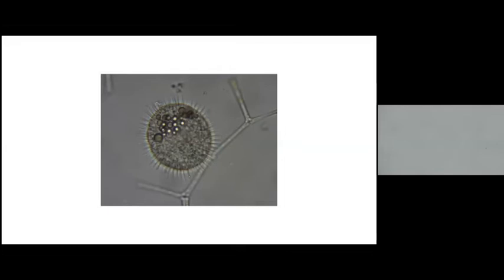I'm noticing that it's pretty circular, right? That might be why someone said cell. Another reason someone could have said cell is because it takes up the entire field of view in the microscope. So we know it's pretty small, right? That could be another reason.